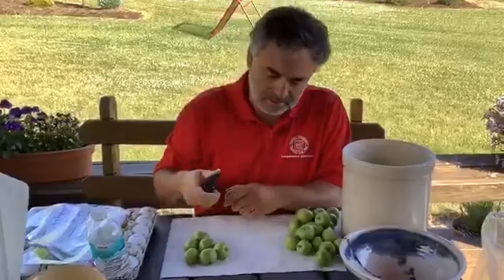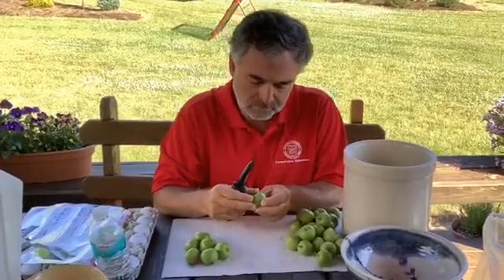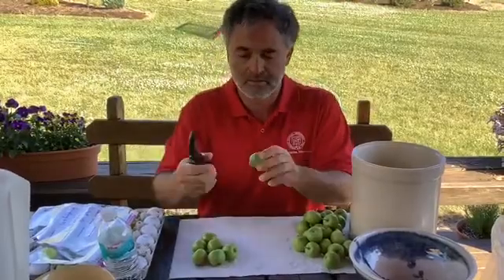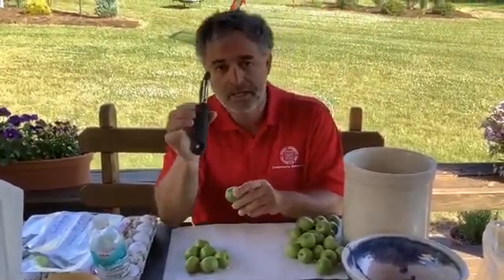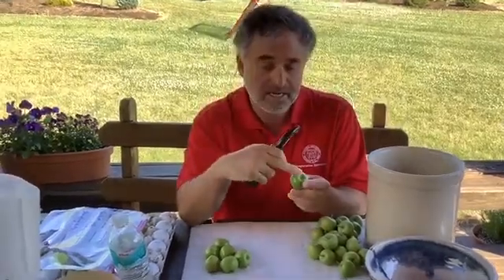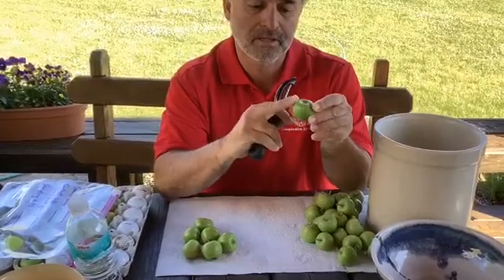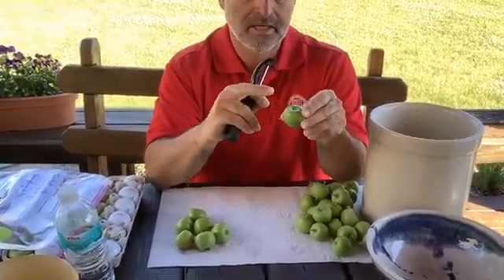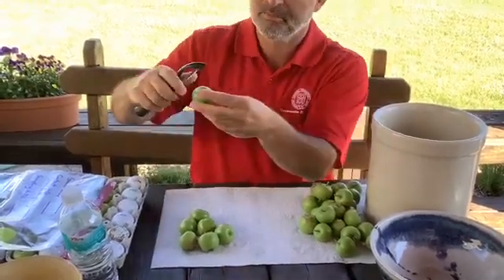So now this is one of the most important sections of this protocol for 2020. We have the 30 fruitlets very clean. You cleaned them previously with purified water, but now with a peel knife you're gonna get the peel from one of the fruitlets from opposite sides. So you're gonna peel on this side and you're gonna peel on this side. You're gonna go from the stem end to the calyx end and the opposite side. So let me show you.